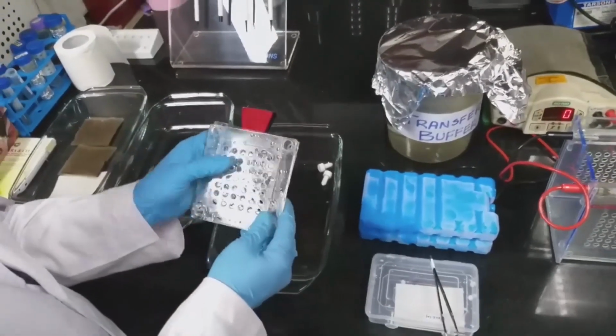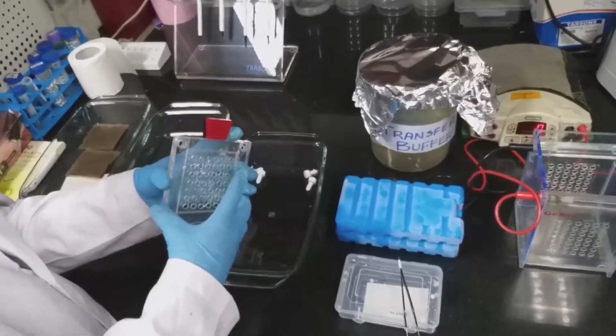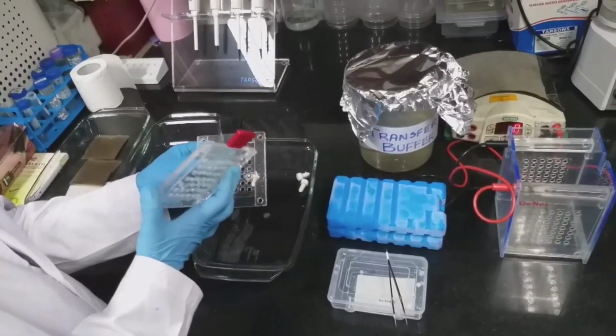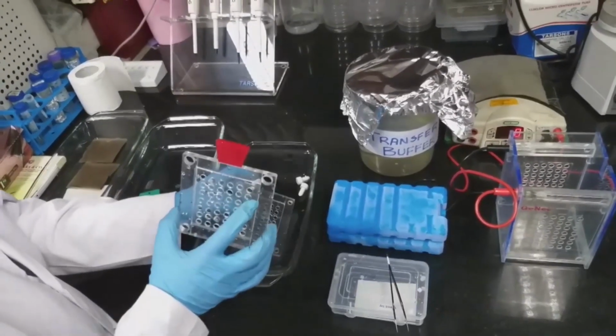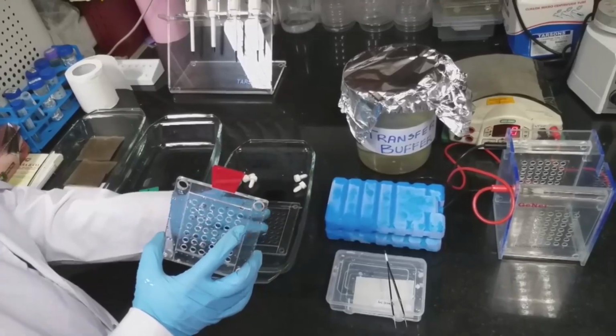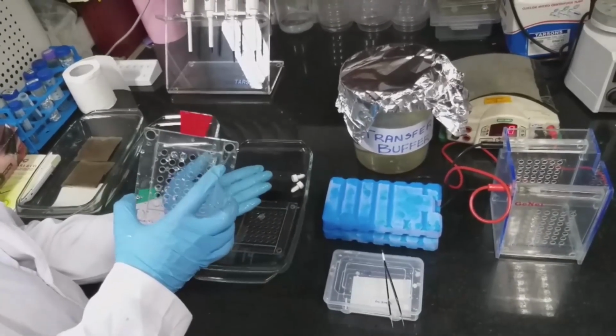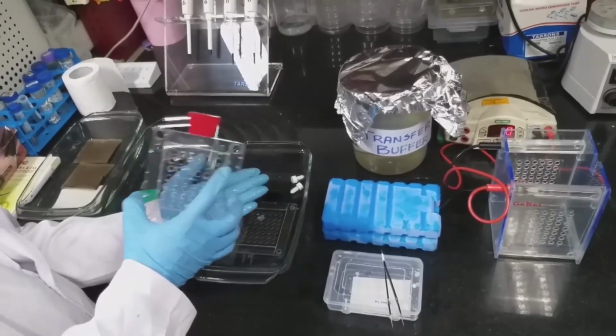This is the cassette we'll use for the transfer. This is the negative side of the cassette and this is the positive side. We are going to keep the gel on the negative side and the blotting membrane on the positive side.